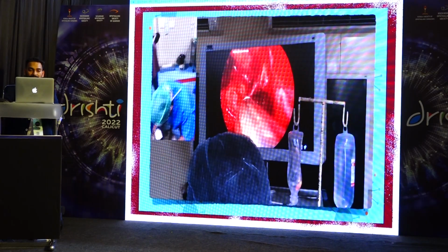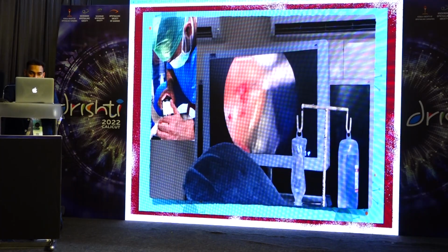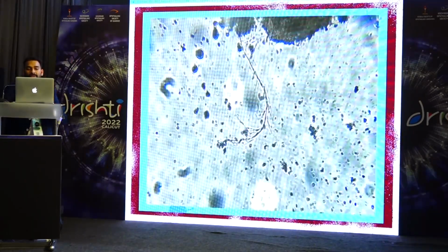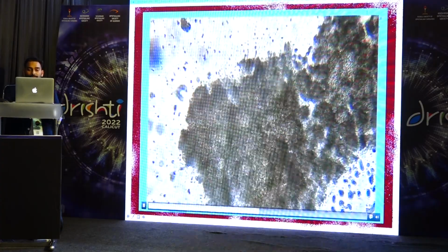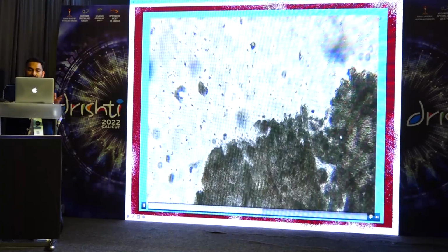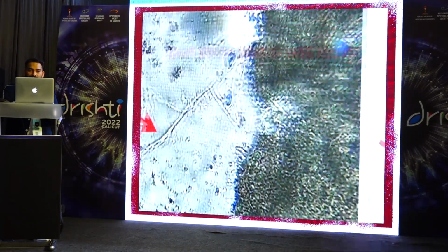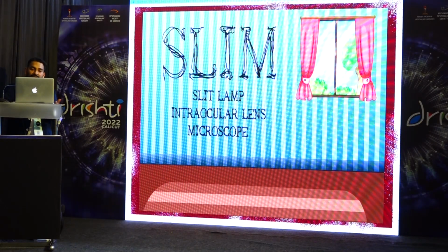During live surgery, he gave a specimen from the paranasal sinuses, and we started cutting sections and checking for hyphae, and you can see over here such a big hyphae material. Just to prove that this was a fungal hyphae, we took it to the microbiology lab and checked it, and it was similar. You can see how clearly it could be seen. So we described this, and then the next was SLIM.